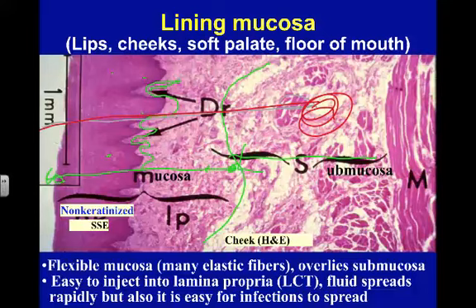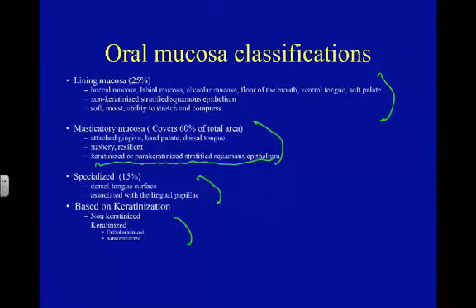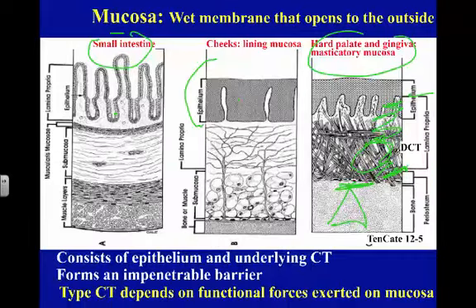So what we want to do is understand that it is relatively thick. When we take a look, I'm going to go back over here. In this, see here, I'm just going to mention this to you.